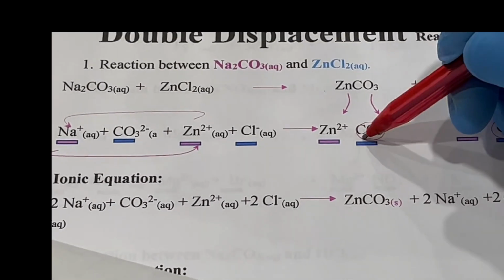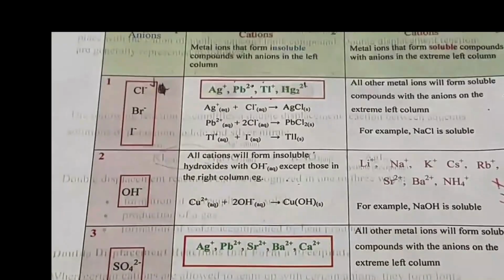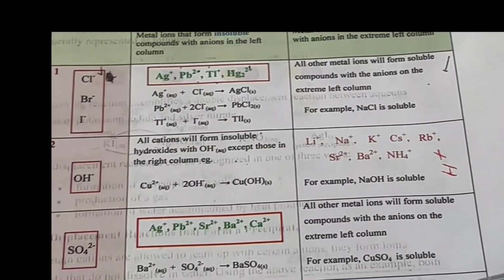Now we'll check for zinc carbonate, okay? So go where carbonate is. Carbonate is down here.